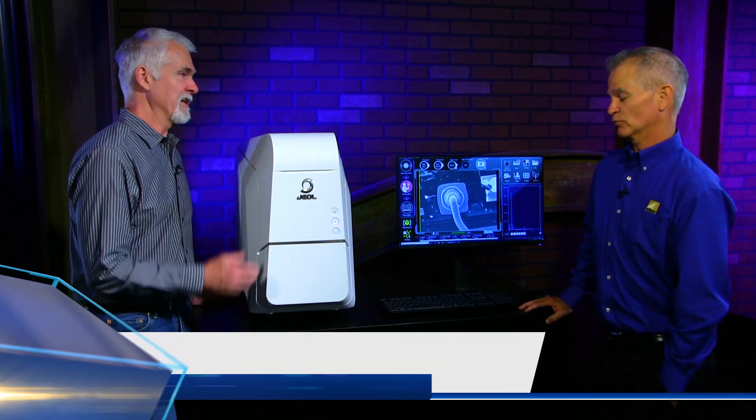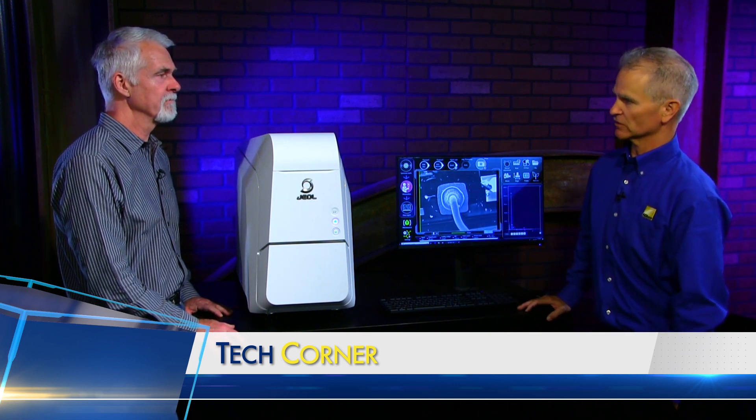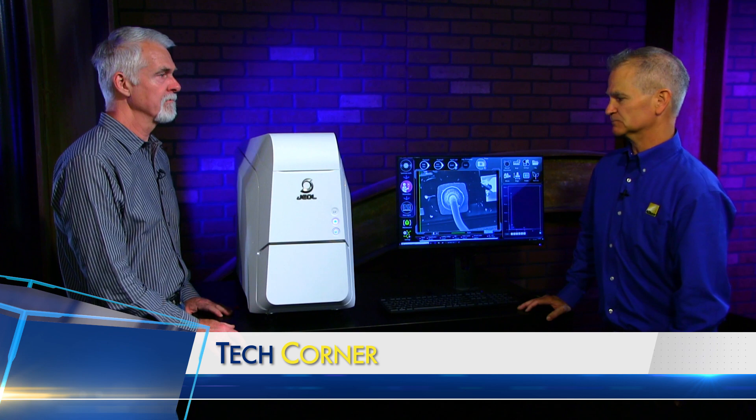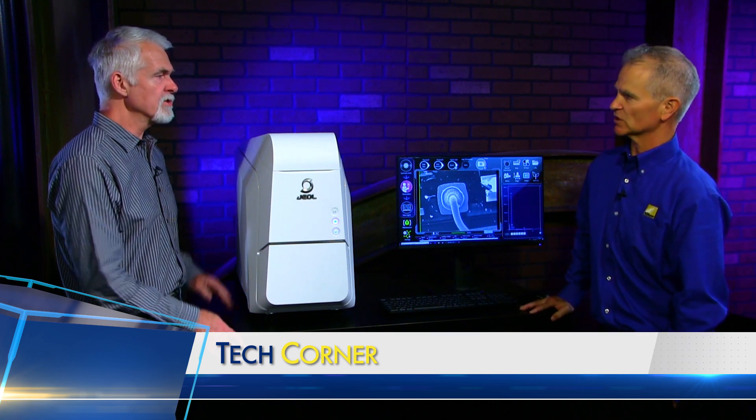Very quickly, within a couple of minutes, you get an image. Is that good enough, or maybe you have to take it somewhere for multiple hundreds of thousands of magnification? That is one application, but we also sell these just as a standalone. Maybe somebody just wants to get started and they need an SEM — maybe this has enough features that's all they need is just the benchtop system.